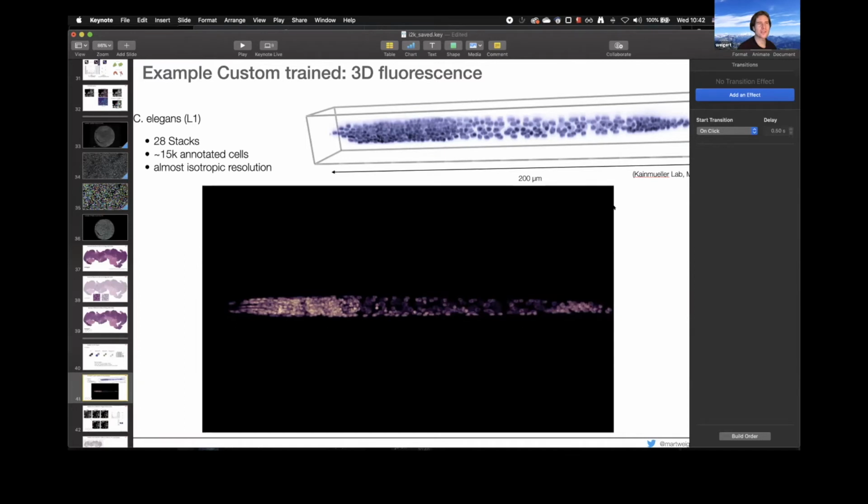Typically you will always get the same relative resolution. So what you will miss on the edges, the proportion of that compared to the complete nucleus, will more or less stay constant. It's just the absolute number of pixels that you will miss that will change. Now the question is whether that is really super important to your pipeline or not. If it's really necessary to get like 5% accuracy of the area, because that's super important for a biological question, then of course StarDist can be used only as the first step anyhow.